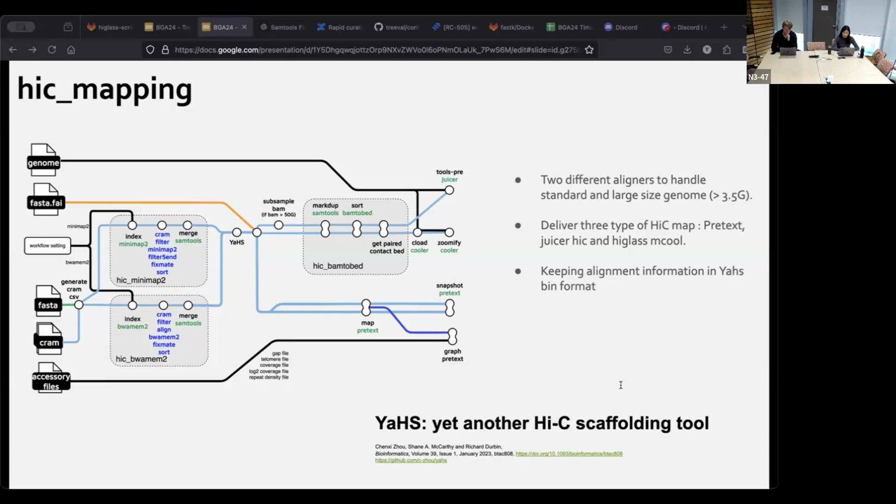Our approach involves using the Hi-C map alongside other evidence to fine-tune the existing assembly, aiming for a clean diagonal only, as much as possible. So that's the ultimate aim. Although most genomes cannot reach that state, we try our best and utilize all the evidence we have. Here's how our workflow works.